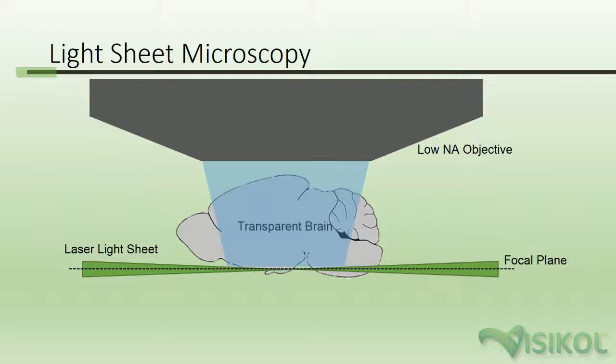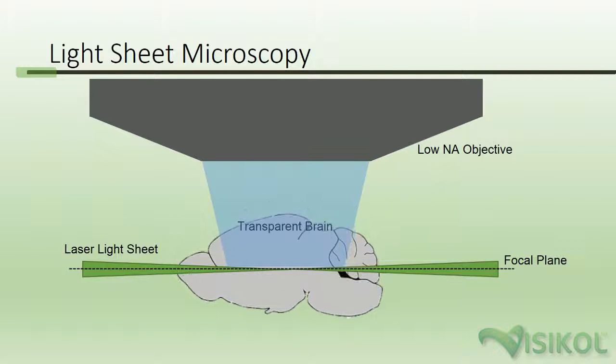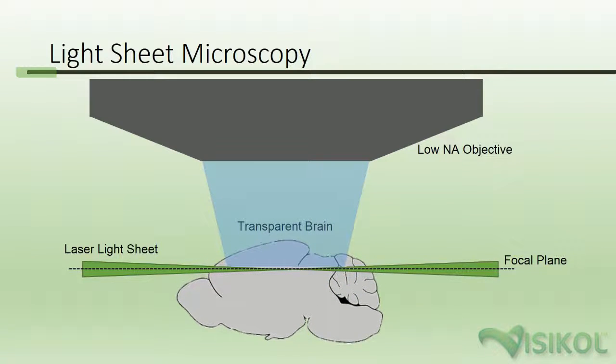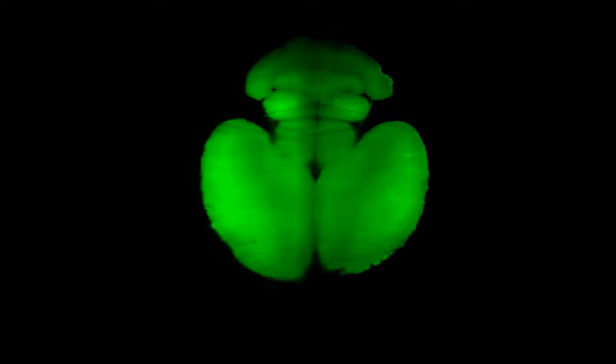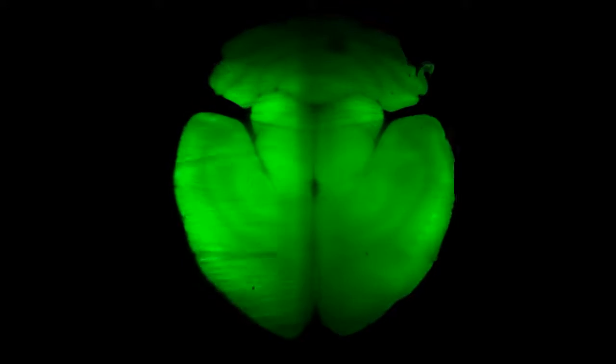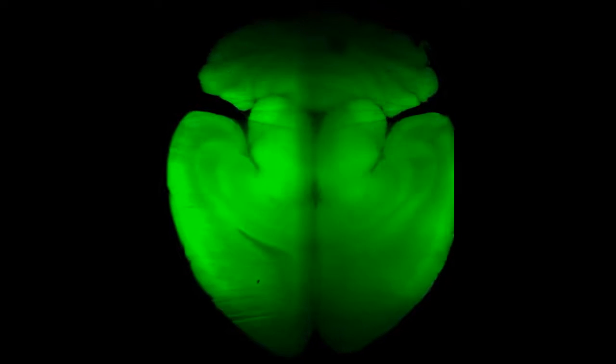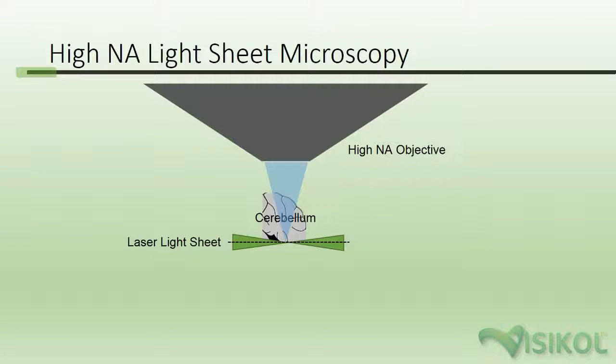Therefore, the objective only captures the emission of fluorophores in this thin light sheet. By then moving the sample through the light sheet and capturing images as the tissue is moved, a Z-stack of images can be acquired from the entire depth of the tissue. This process can be clearly seen here where a whole mouse spinal cord cleared tissue is imaged for autofluorescence using an Ultra Microscope from LaVision. The streaking in the tissue is caused by refractive index mismatches in the mounting solution that cause optical aberrations.